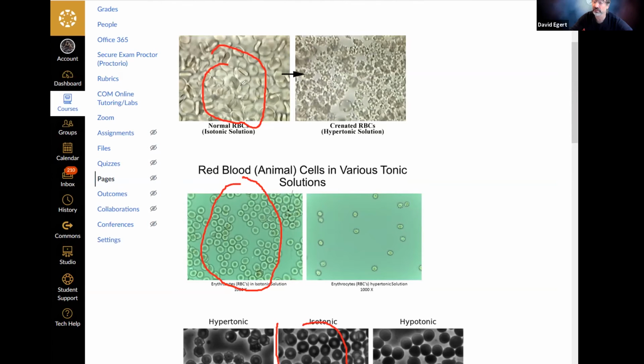This is the cells are happy. This is what a normal red blood cell looks like. So it's definitely not going to be urea. So that might be an isotonic solution. Yeah, like the 0.3 of the NaCl, this tube 4. So it'd be like the 0.15 molar NaCl or the 0.3 molar sucrose, right?